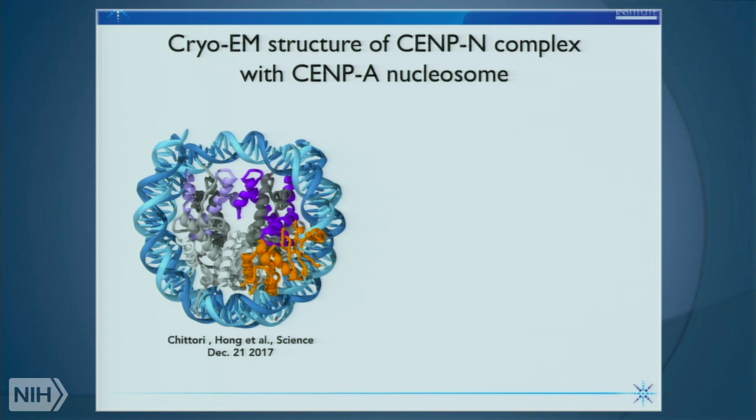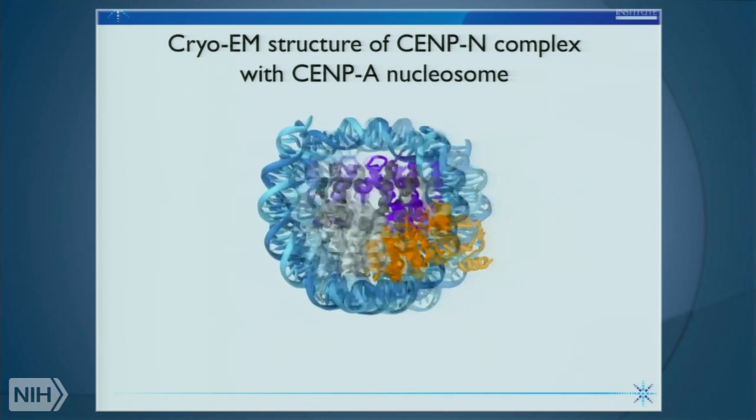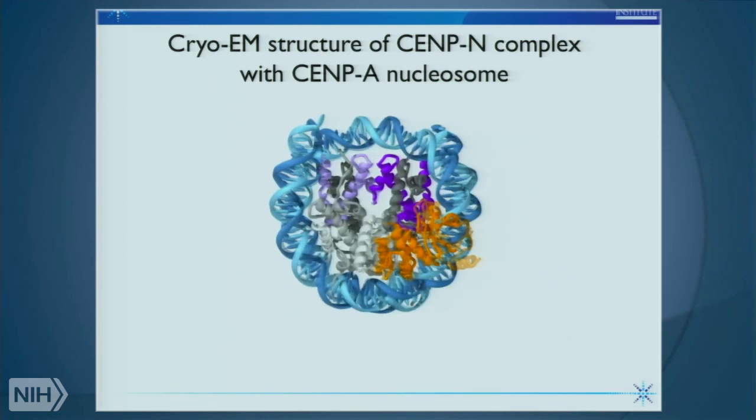Another unique, interesting aspect to this work was that as we were doing this and published it, a few days later, work appeared from Carolyn Luger's lab and Andrea Musacchio's lab, where they had the X-ray structure of the CENP-N molecule. And for many months, we were quite nervous about whether we had done this right or wrong. But fortunately, and we could sleep well after this, we could show that the structures indeed match very well.